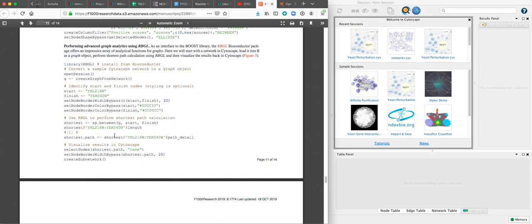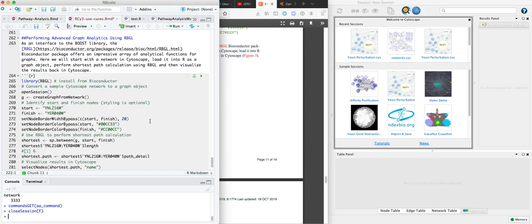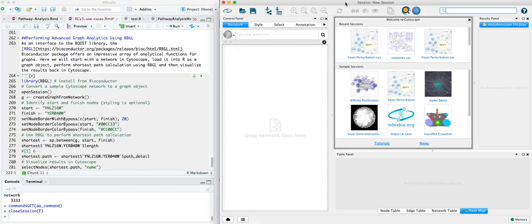The code in this use case is available as an RMD that I'll link to below, and we're going to open that in RStudio and have that next to our running instance of Cytoscape.